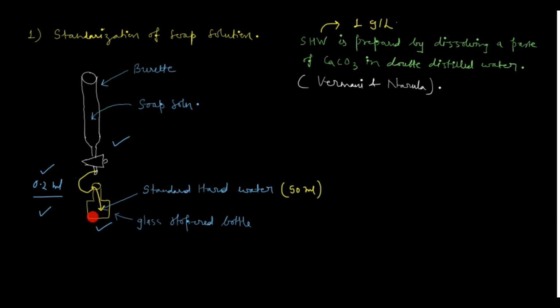That means the reaction has been completed. That volume of the soap solution we will note and do the calculation. We will record that volume as V1 ml.